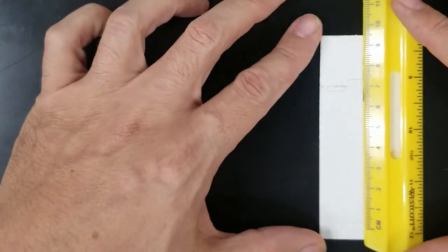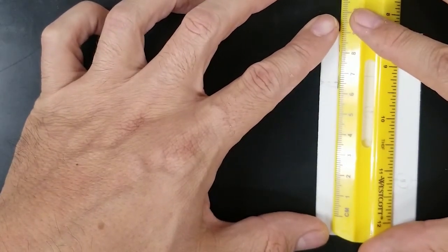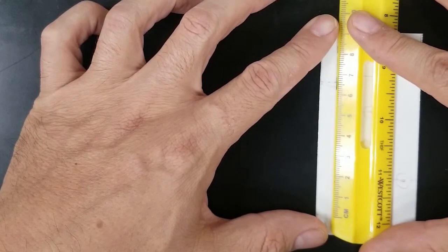Okay, so I'm going to go ahead and put my ruler on there, and you guys can pause the video and get a measurement. So for the acetaminophen, which is the first one, lining it up there. And I'll say about what I think it looks like. Remember, you need to get exact values here. This is looking to me to be about 6.6 centimeters. The next one here, lining up the 0 to this here. This next one here is for aspirin. It appears to me to be about 5.3 or so.